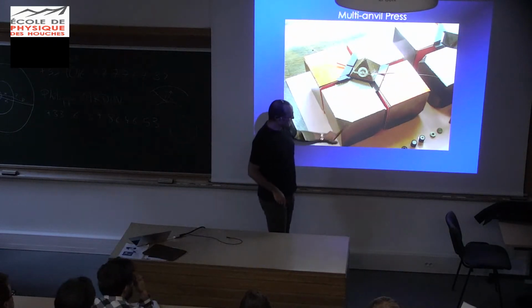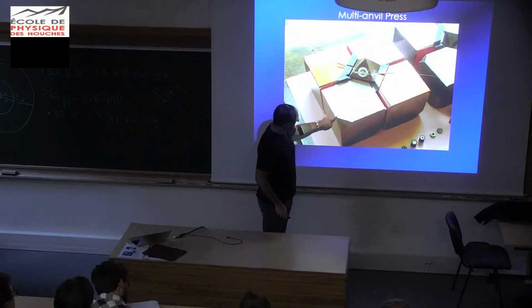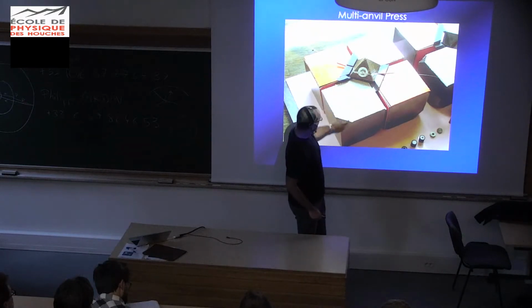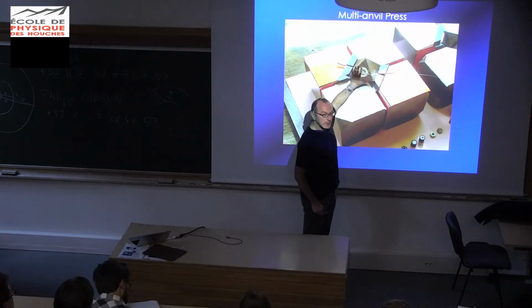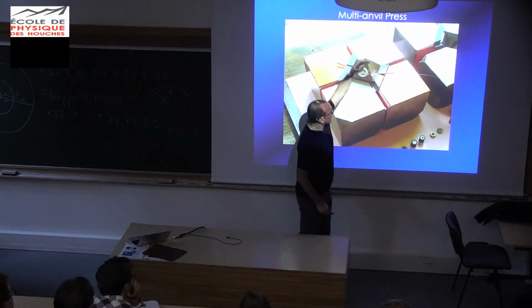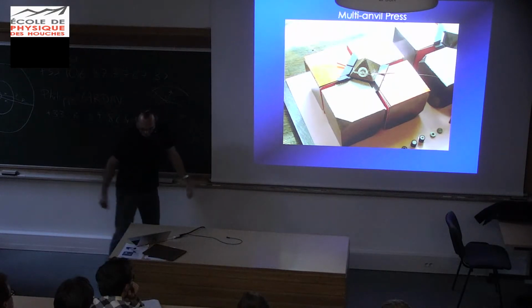And these are the cubes, tungsten carbide, very hard material, that have the triangles. And so you have these little truncations here, and each truncation comes and sits and is going to push on one of those faces. So you have 4 in the bottom, and you're going to have 4 on top. You can see the truncation here, okay?